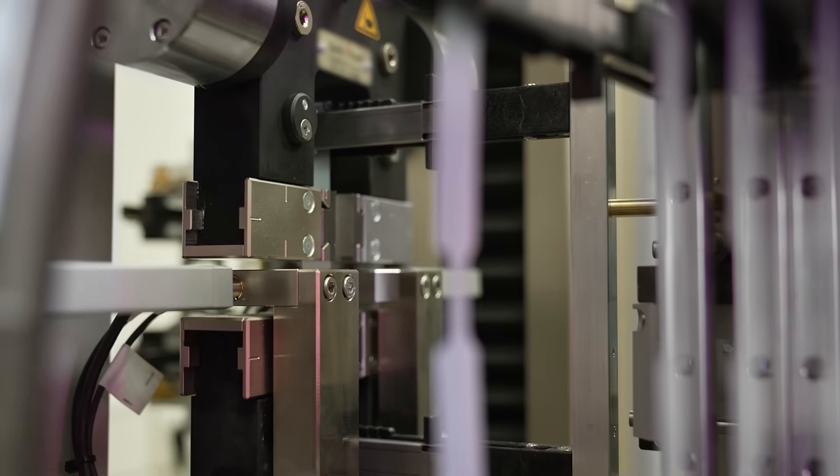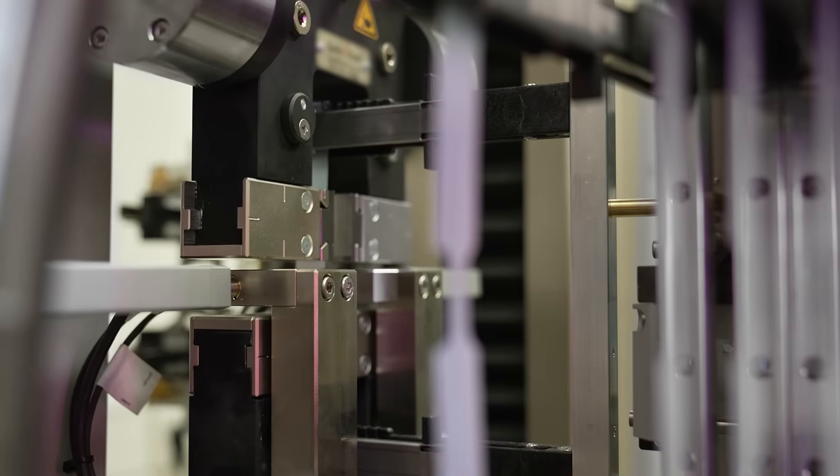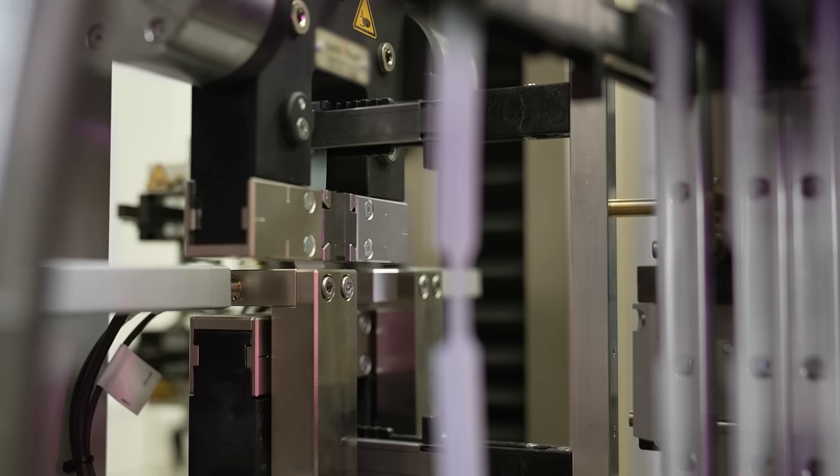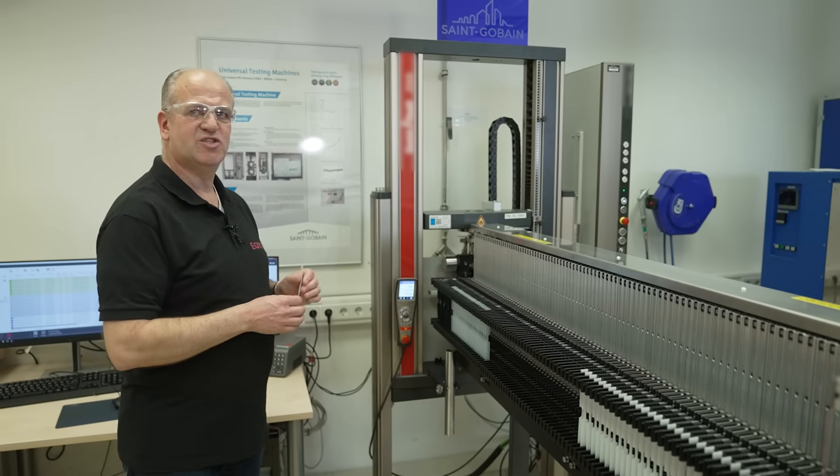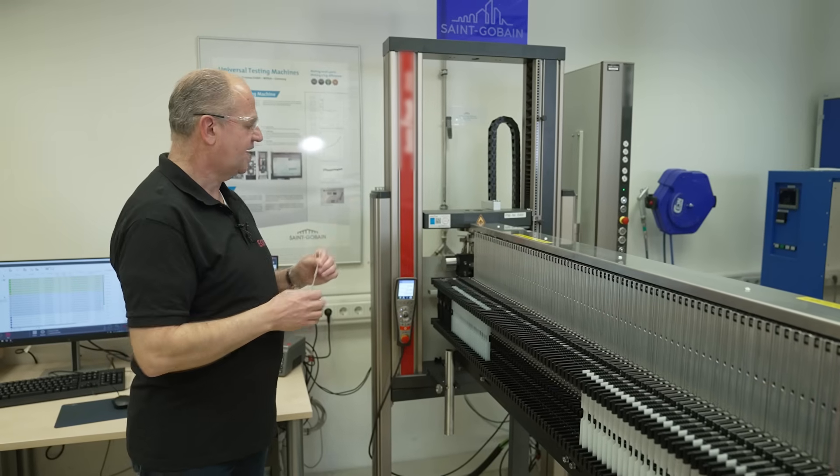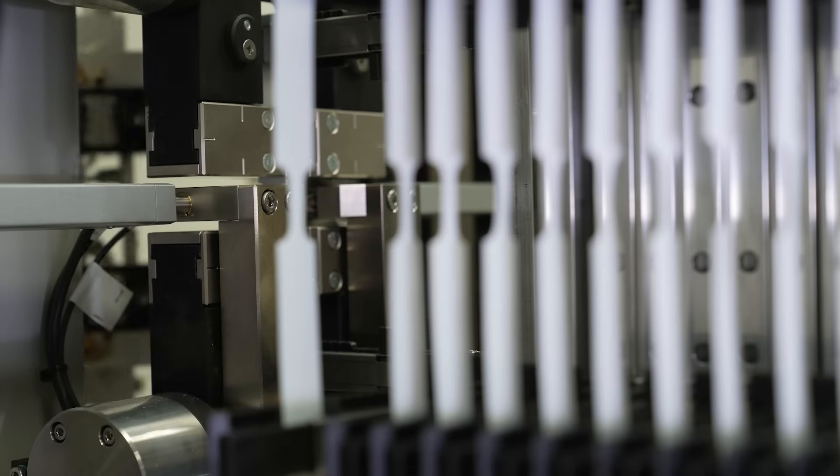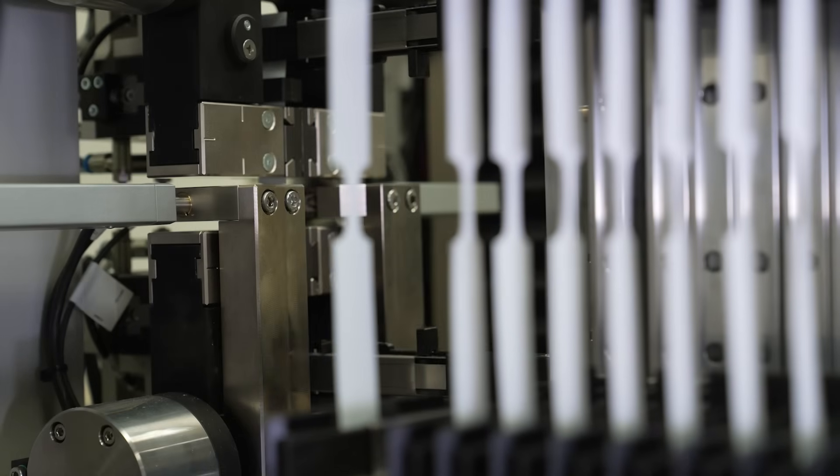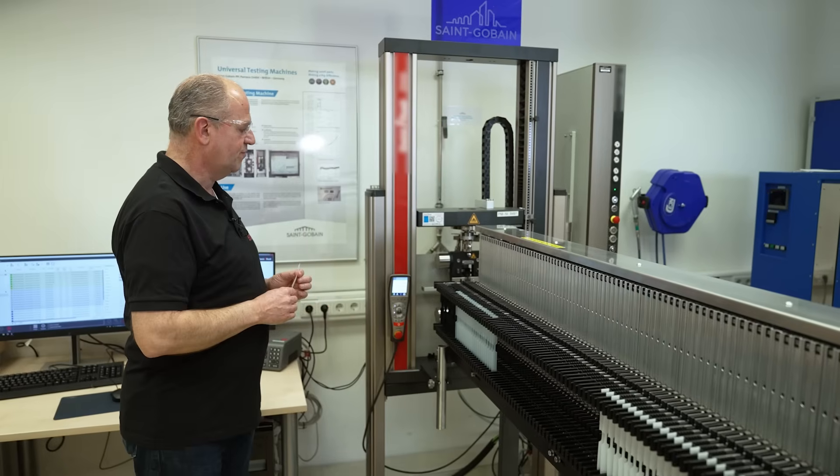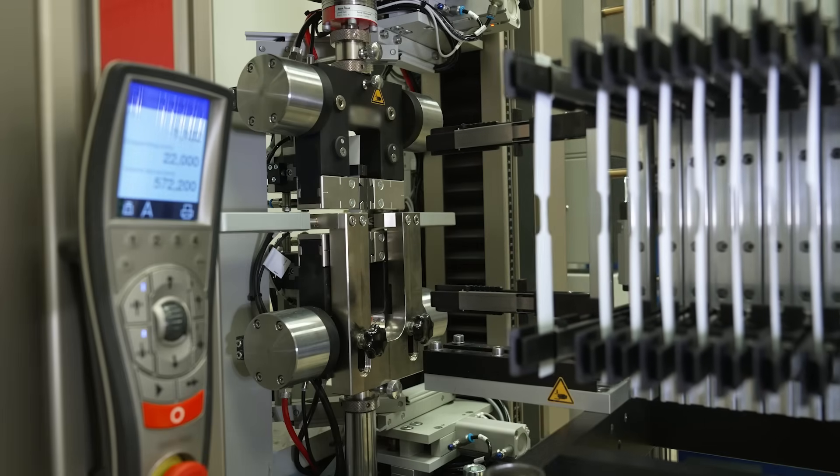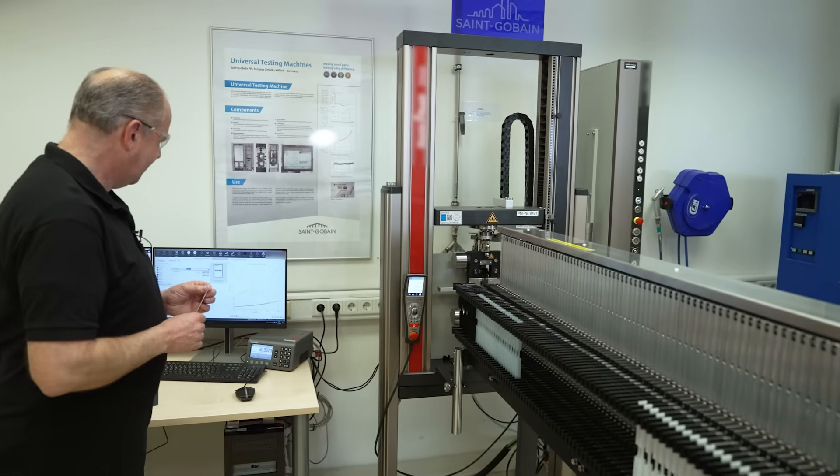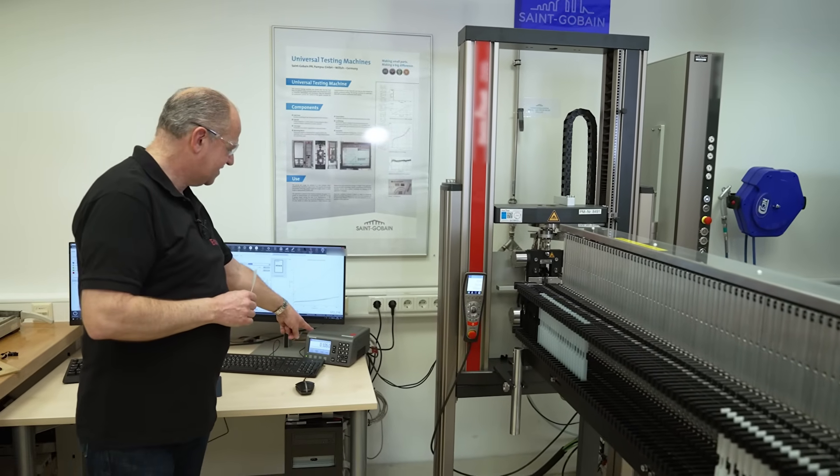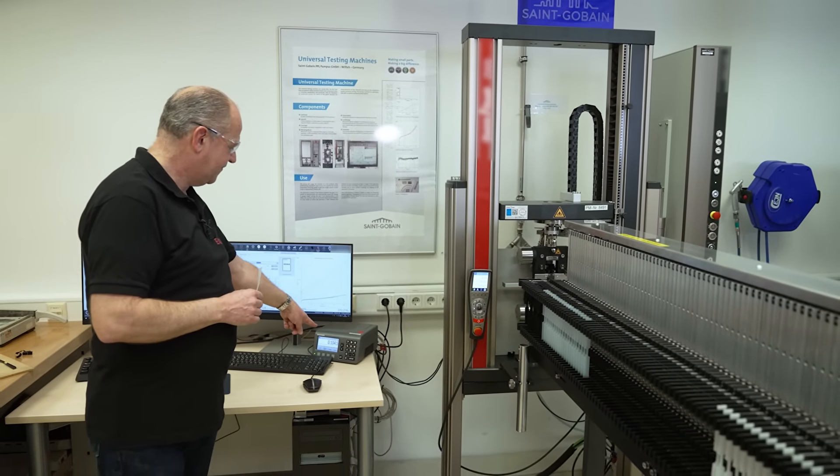The sample is now clamped automatically, and after clamping, we do the thickness measurement of the sample here. It takes one to two seconds. The magazine is now removing out of the system, and now the thickness measurement starts of the sample here.